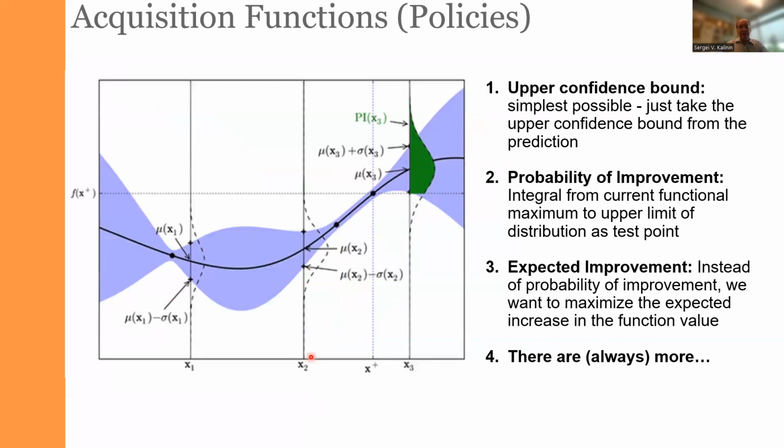That being said, very often Gaussian processes try to do something more complicated than just discover the function. They try to optimize the function. For example, if I tune the microscope, I'm not really that interested in how the aberration behaves away from the optimal setting. What I really want to do is to find how the aberration operates close to the optimum, so I can find those optima. So how to tune my microscope sufficiently well.